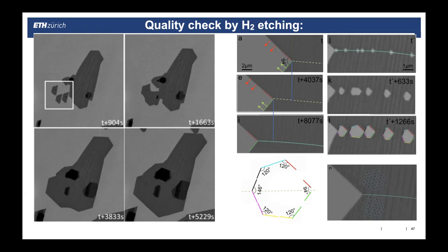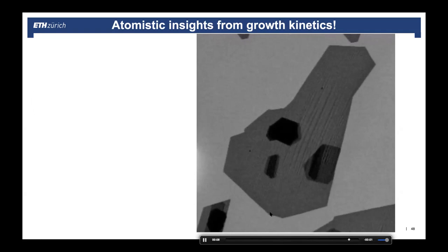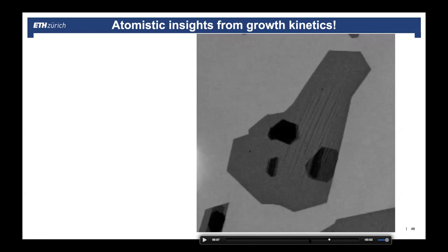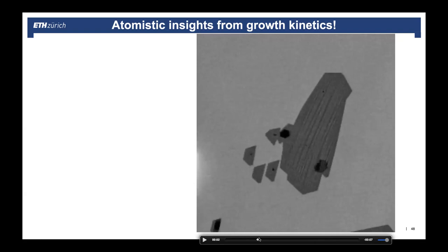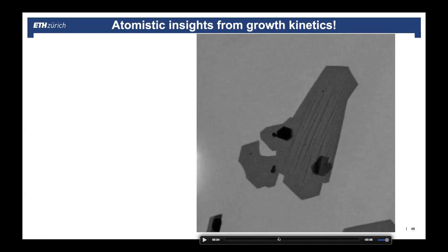And you see there's a concave edge, it whoop, closes. There's a concave edge and whoop, it fills up. So it started laid back with a concave edge and it filled up very fast. I'll do it again, because I would like you to know what I mean. So for example, these two will soon touch. It happens basically around now. And as soon as they touch, this negative angle here fills up extremely fast. Just look at how fast this corner grows versus that concave edge. You see the concave edge fills up like nothing.